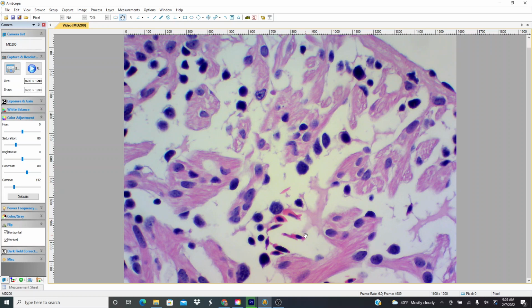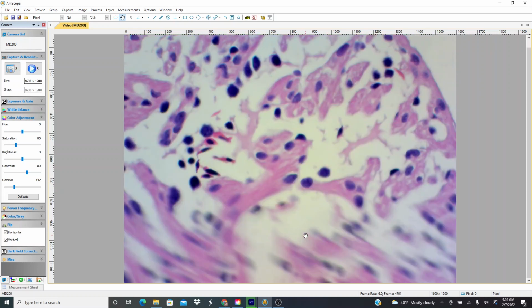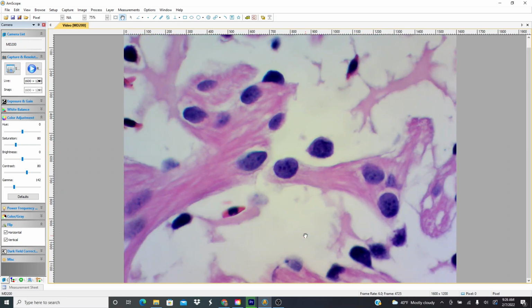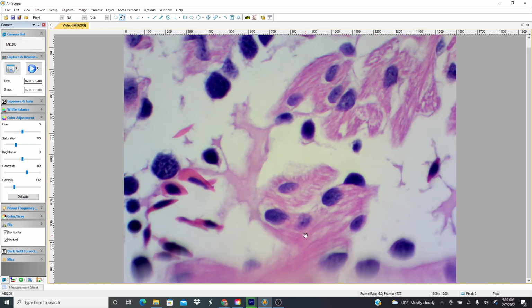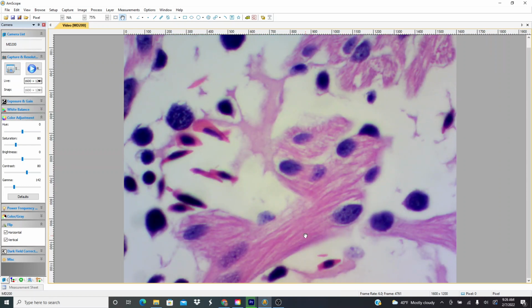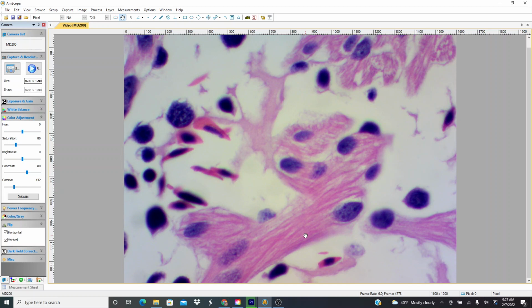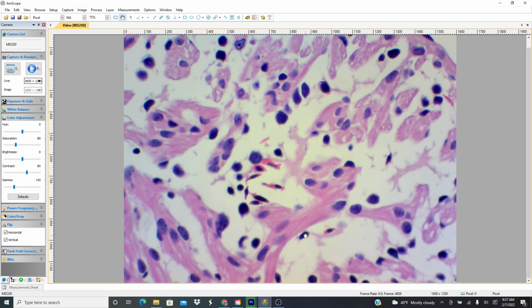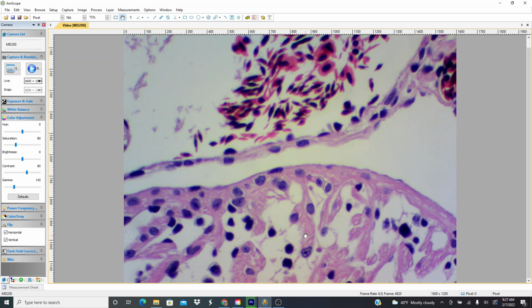Now, these little things here, these must be red blood cells, and compared to an adult human, these have a nucleus in them, and adult red blood cells in humans do not have nuclei. So this must mean red blood cells circulate and divide in the blood rather than in bone marrow. But, like I said, I'm not sure. I don't see any other cells.